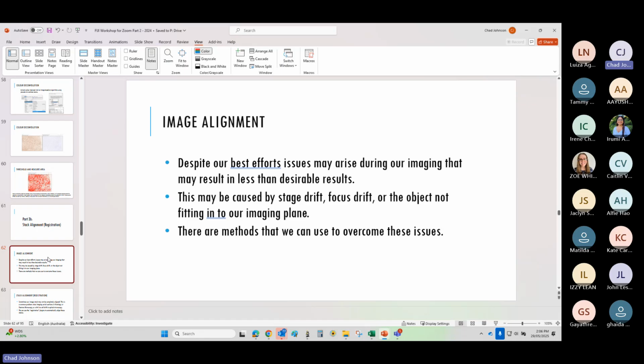It's also a massive problem in serial sectioning. If you're doing serial sections in either histology or EM, you would have your sections across multiple slides, stain them, image them, and then you can stack them on top of each other. But because of the way that slides are processed, they're never the exact same orientation. So we can use registration to do this for us.